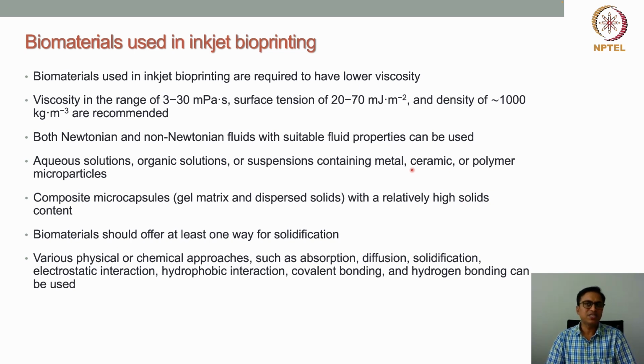There are various physical or chemical approaches used to achieve the solidification process, so that the structure gets stabilized. Something like absorption. Suppose after the generation of droplets and placing them on the stage or substrate, they get absorbed very fast. In this way solidification can be achieved.